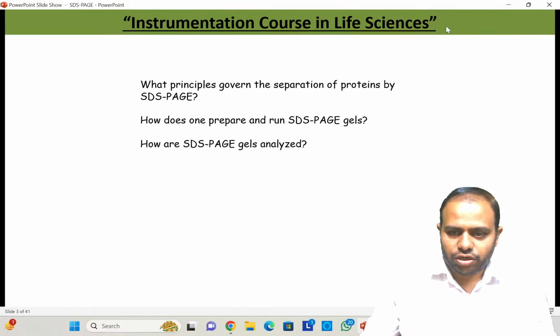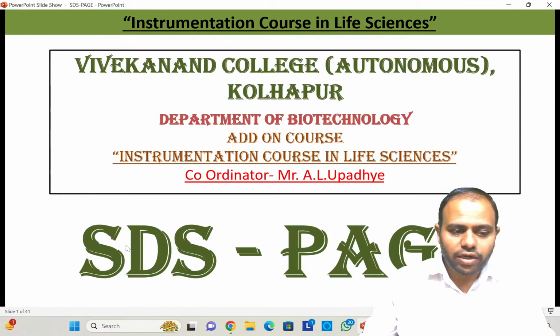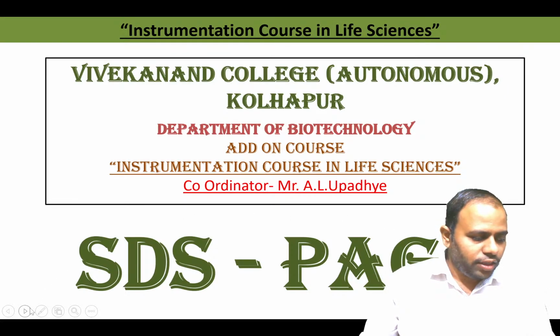We'll start our lecture now. The topic for today's lecture is the instrumentation course in life sciences. Let's see what the different things are that will be covered in this. Today's topic is from unit number 4, that is SDS PAGE. We are going to begin with SDS PAGE now.